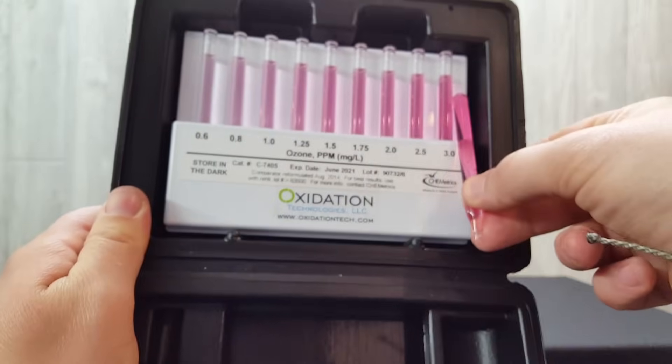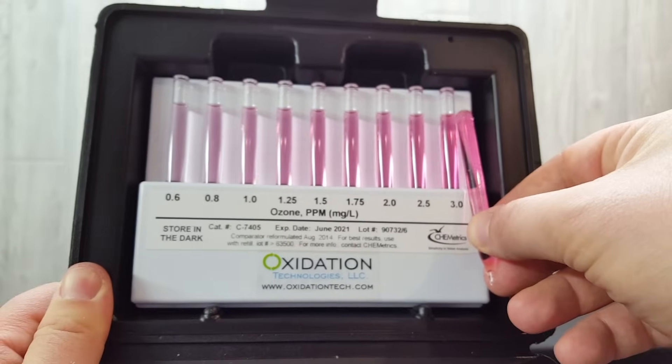Keep in mind that diluting the sample does decrease the accuracy somewhat, but it will still be reasonably accurate.